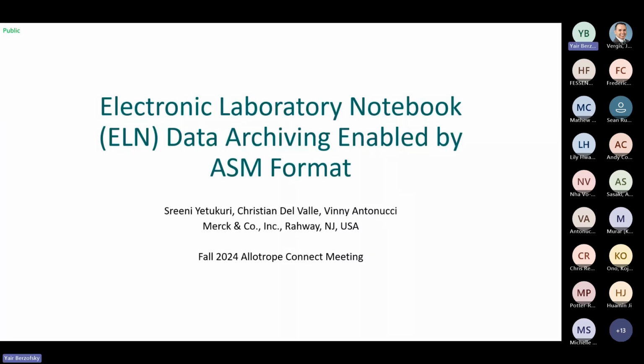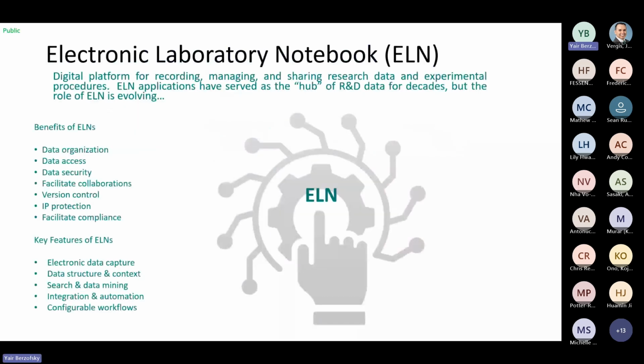Good morning, everyone. We are all familiar with our notebook. Even we use one at some point in our career. So the electronic notebook, ELN, and Laboratory Information Management System, LIMS, were basically the first two applications implemented decades ago that began the transition from a paper-based laboratory environment to a digital environment.